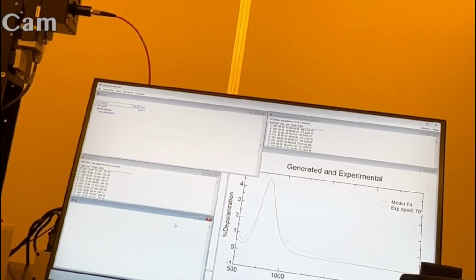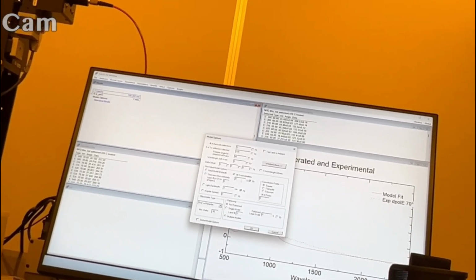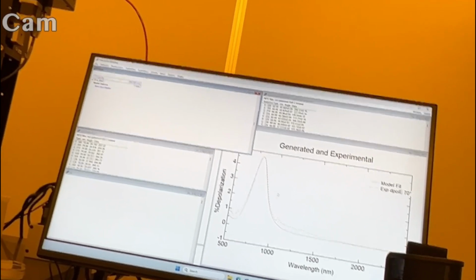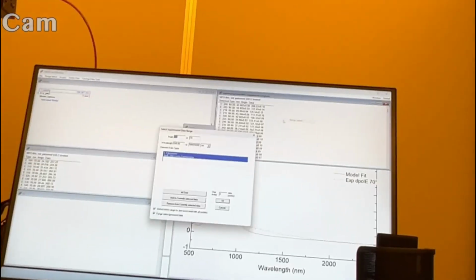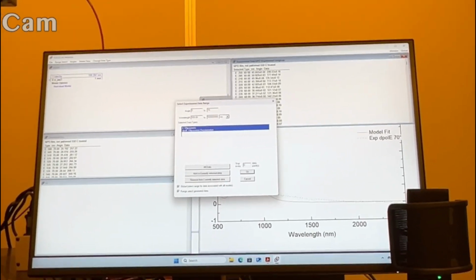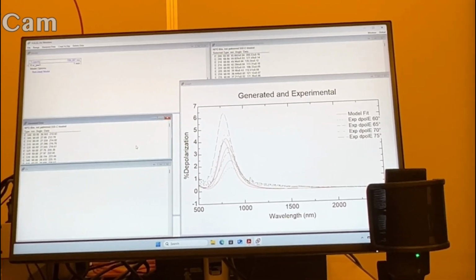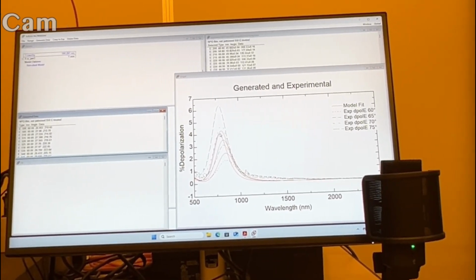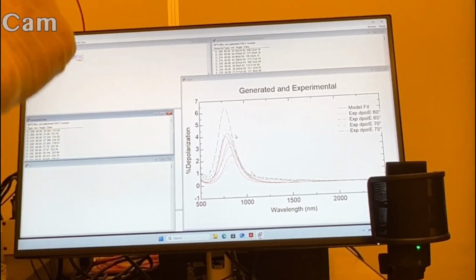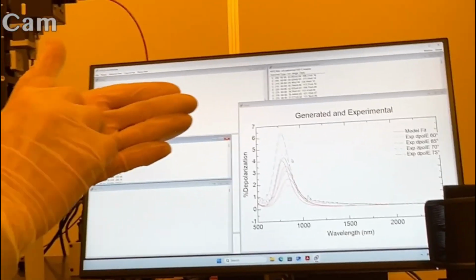So you're going to get a similar thickness result, but for example, if I fit this now, let's assume 0 bandwidth for now, just to show one at a time. If I look at all angles, basically the full range, 0 to 90, and I generate, now it looks like there might be a little bit of difference per angle, and that makes sense because remember my beam is spreading more versus angle. Right. So if we were at the center of the same average, great.